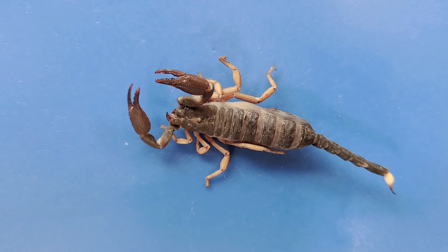Hello and welcome to O-Wyrm. Today we'll be taking a look at the anatomy of the scorpion.